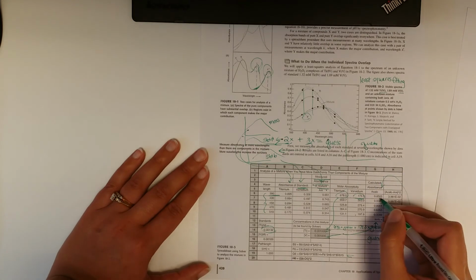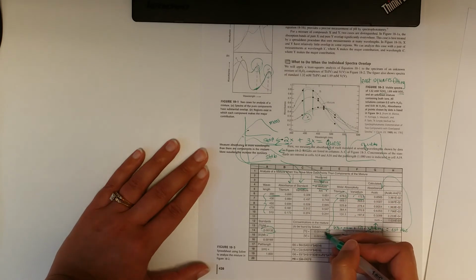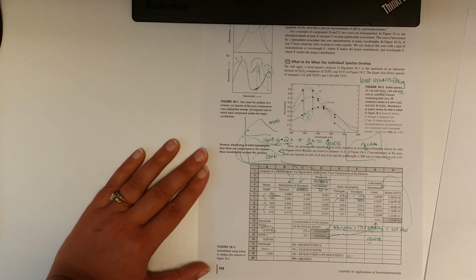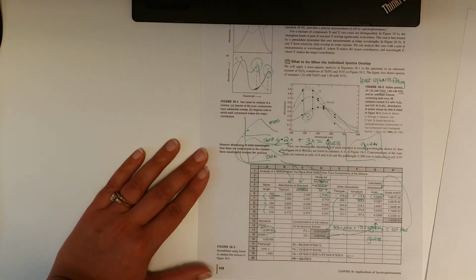So all of this is estimated absorbances where you use the same hypothetical, we're just guessing here, concentration times its path length. You can set up an equation, a spreadsheet, see if you can get these things back. And then we want to compare. Here's our guess, and here's the actual thing.